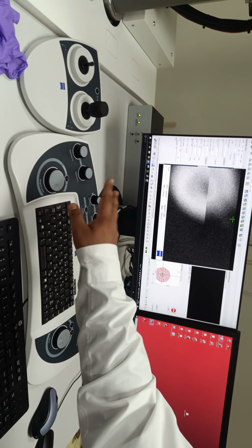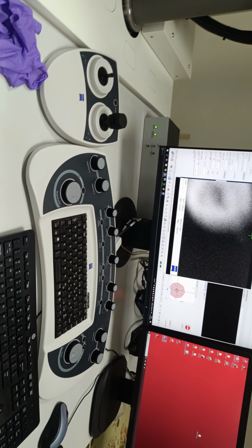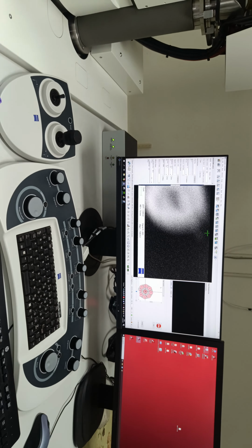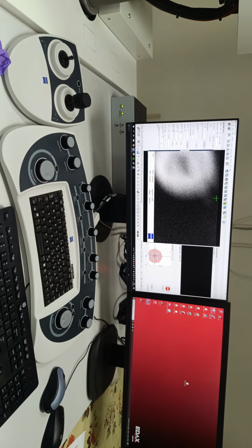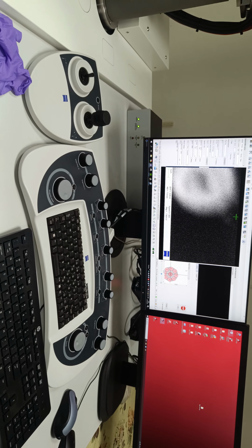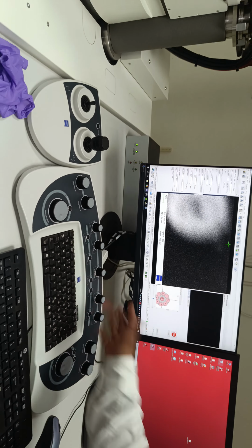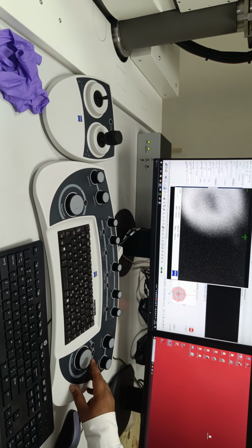These are the two controls, stigmator X and Y, which are the astigmatism coils. We can control the current in these two coils, and by using them we try to prevent that particular error. Now everything is gone, so I try to fix it.